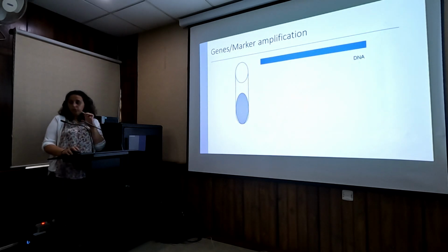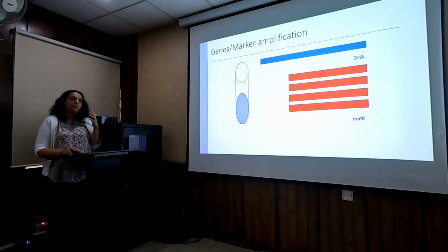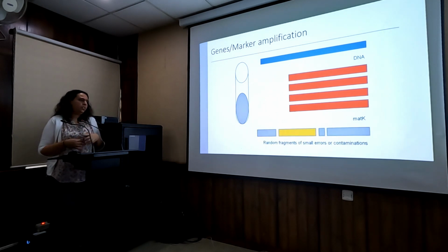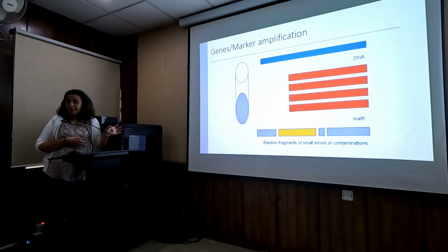So in the end, in your little tubes at the end of the PCR, you will have a bit of your original DNA, which wasn't copied, well, it's still there. A lot of copies of only the region that you want, so that's going to be the majority, so the rest is kind of negligible. It's still there, it's always going to be there when you send it out for sequencing, but that's fine. The majority is the region that you were interested in. And a bit of contaminations, errors of copying, and other things which are kind of minor. So you should know what is in your tube at the end. You don't only get the region that you want, but it will be kind of most of it, so that's fine.